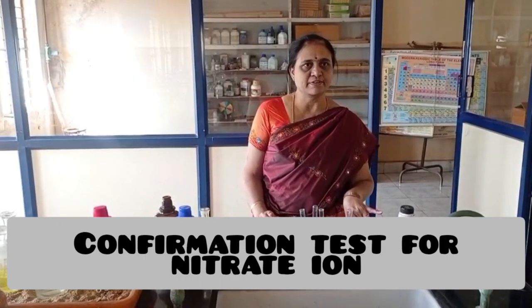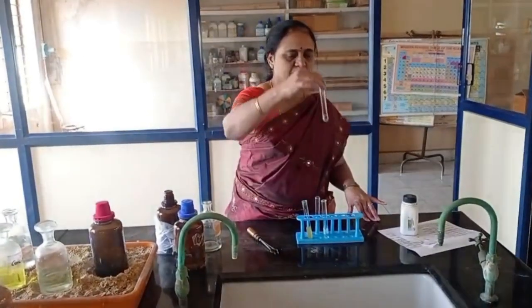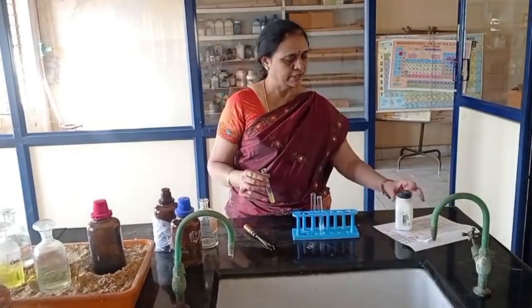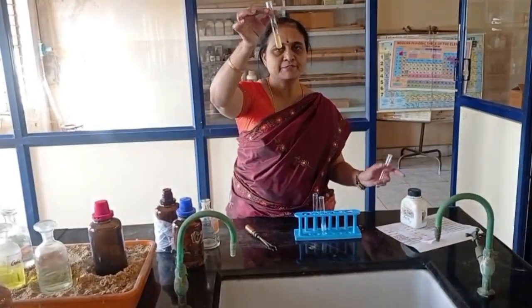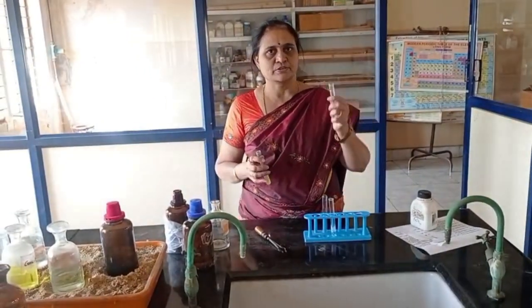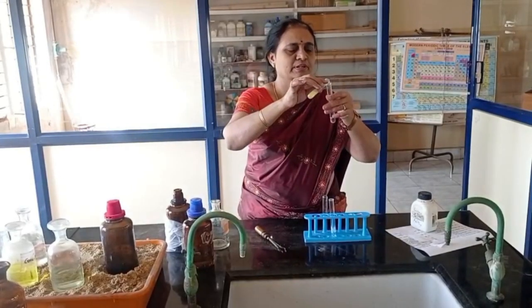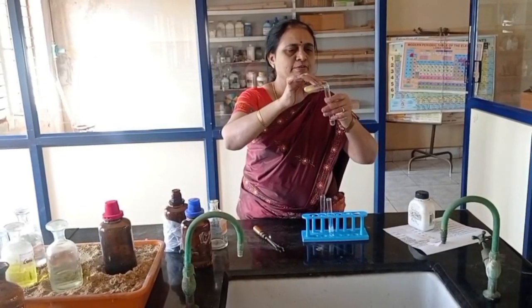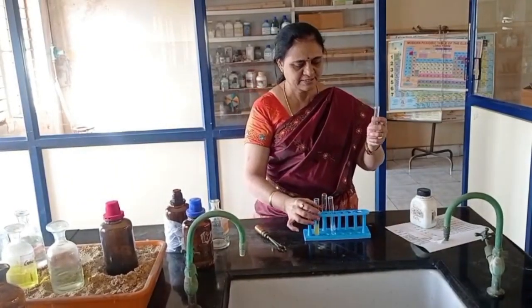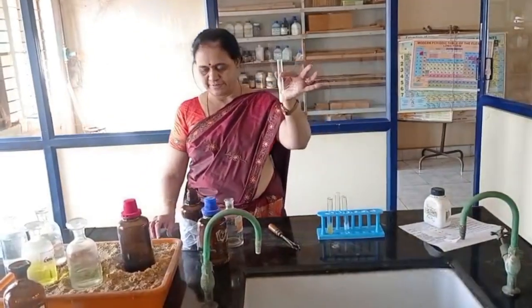Confirmative test for nitrate ion, that is brown ring test. I take salt solution, then equal amount of freshly prepared ferrous sulfate solution. I take salt solution plus freshly prepared ferrous sulfate solution.